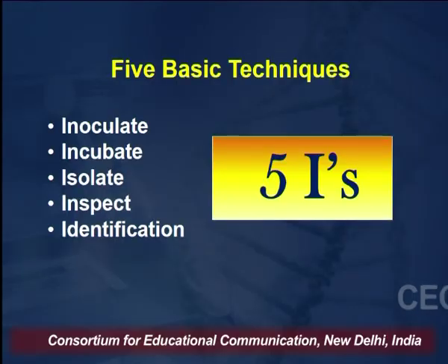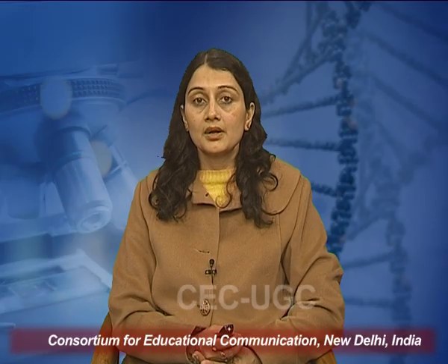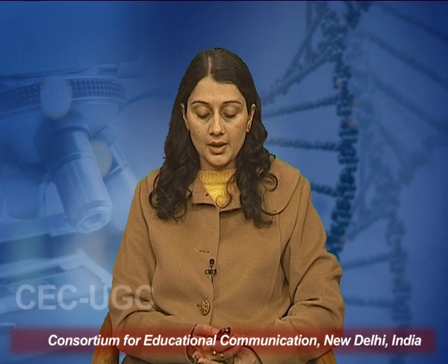The third step is isolate. Once after incubation you have a good bacterial culture, you will isolate your bacteria or your microbial colony of interest. Then you will inspect whether what you have isolated is pure or not, it is free from contamination or not, and then you will identify which culture you was using. Is it the same or it has got certain mutation? So these are the 5 I's of the culture media preparation.